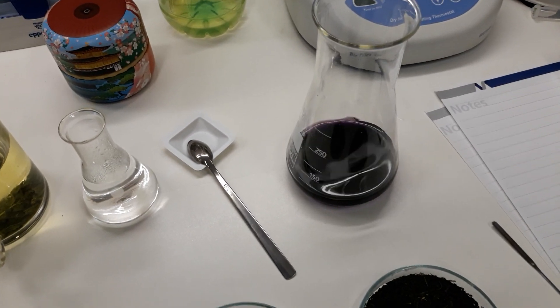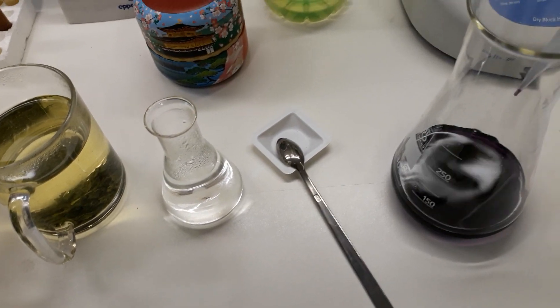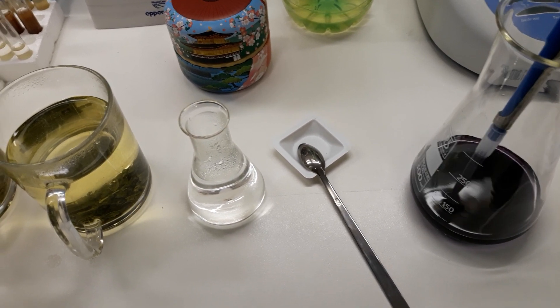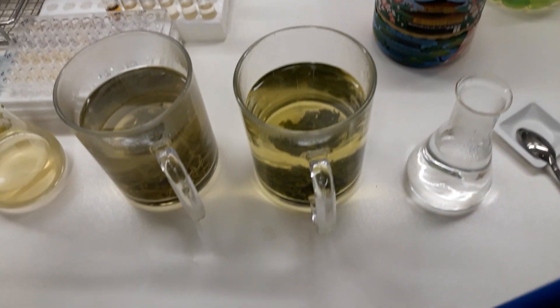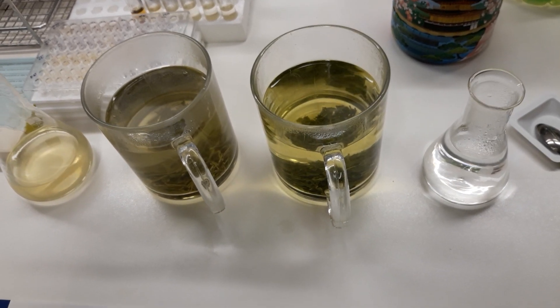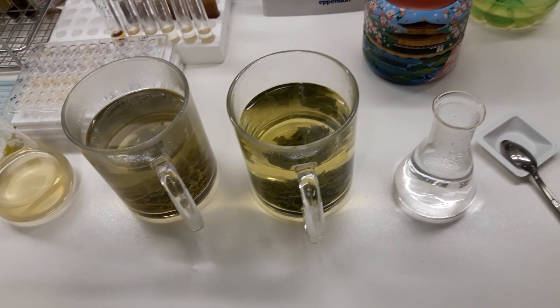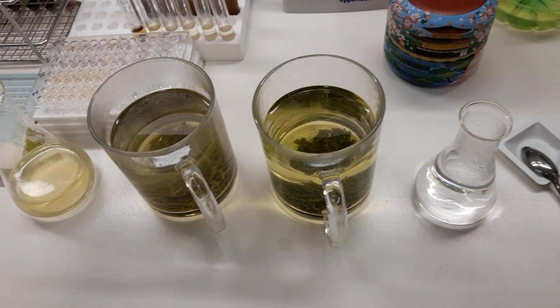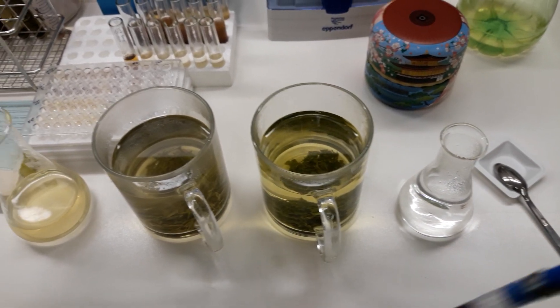DPPH is a synthetic free radical that we are using to demonstrate or measure the antioxidant property of different samples. What I will do is add two milliliters from this DPPH solution, which was already dissolved in alcohol — actually in ethanol — and we will continue with the rest.